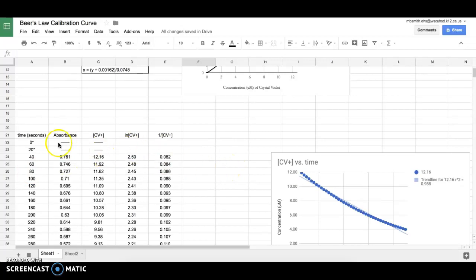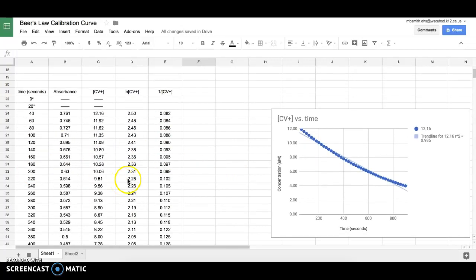You don't have to put this into your laboratory notebook, so it doesn't really matter what this looks like. I just like it to look pretty. You will include your three graphs into your laboratory notebook. Actually, maybe you should put that in there. It sure is nice, and it'd be easy to print. But that's up to you guys.